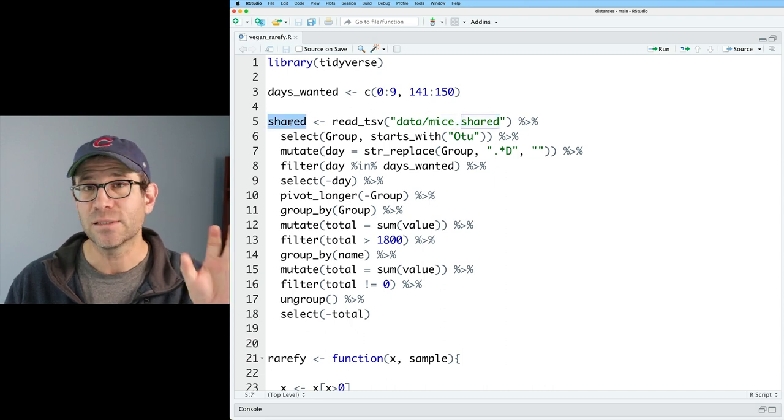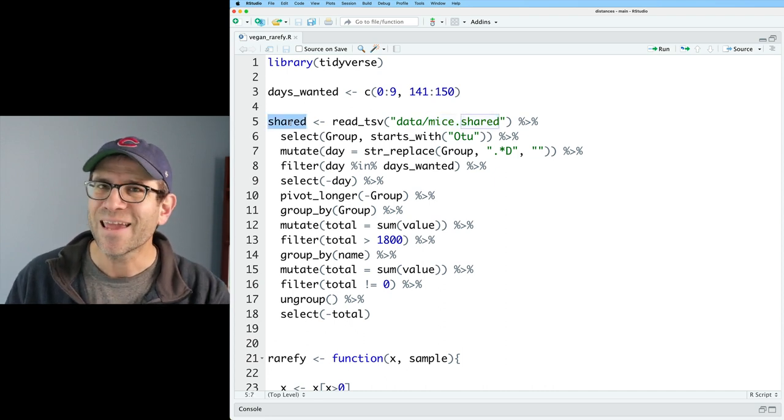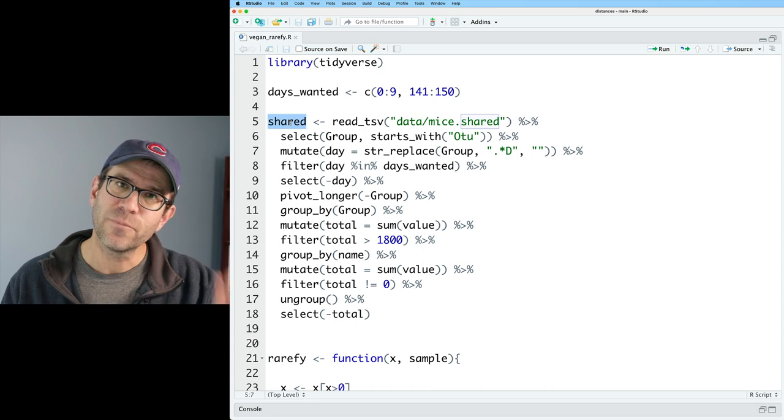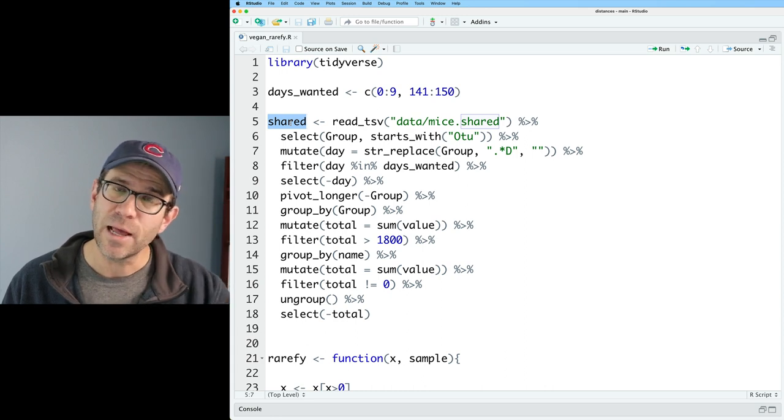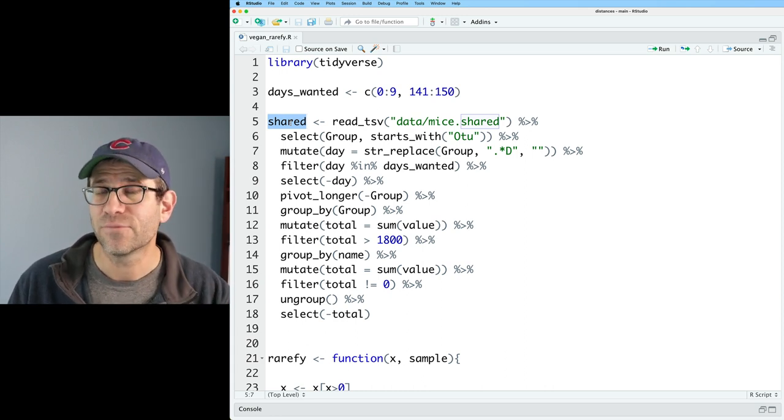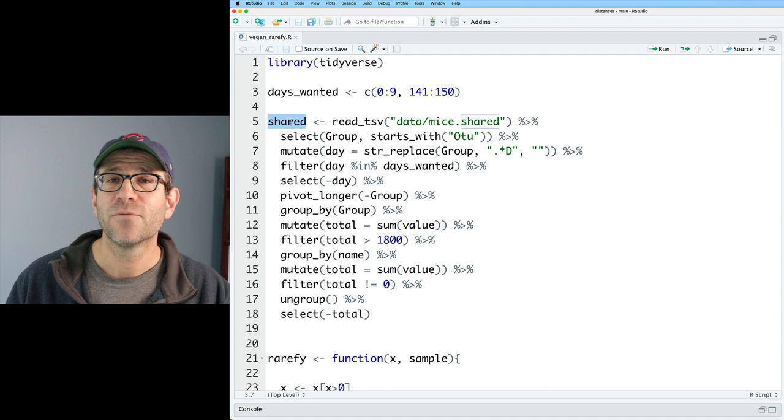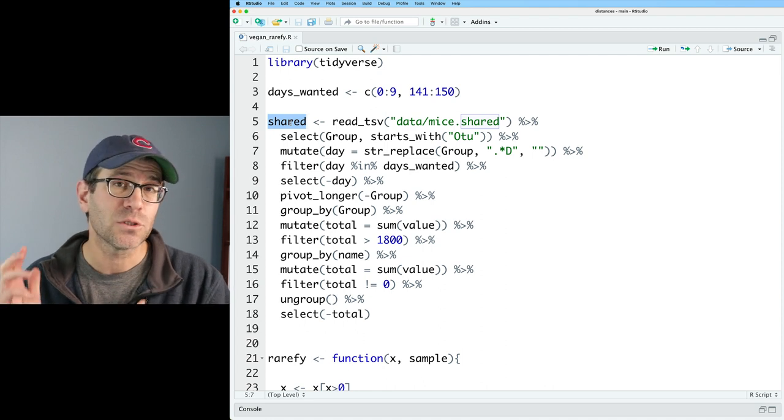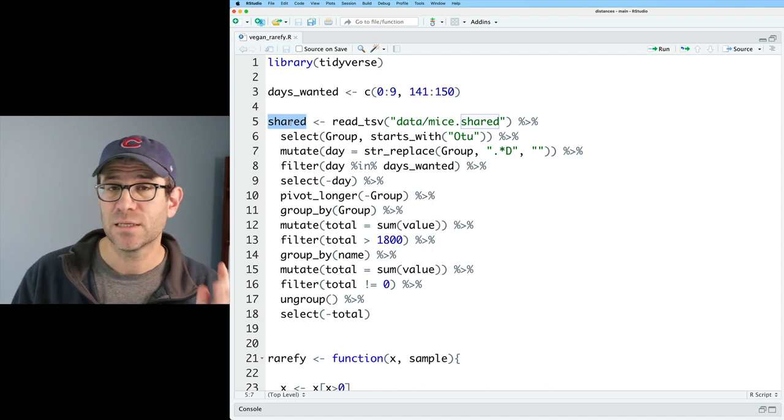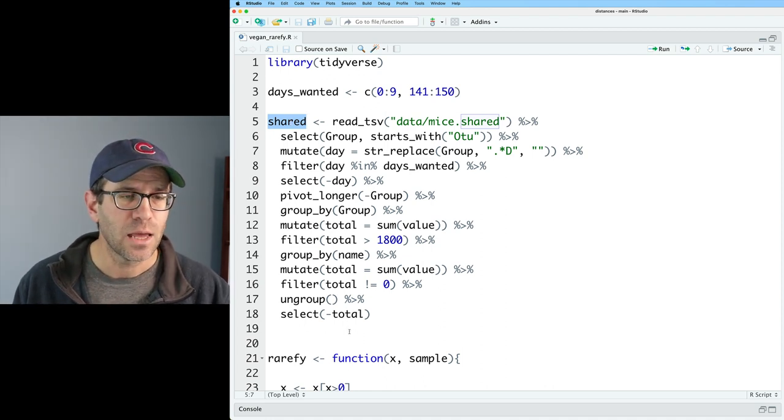So that's why I want to spend a little bit of time showing you how we can go through an object, a data frame, a tibble, like shared, which has a column for the sample ID, a column for the different taxa, and then a column for the number of times we saw each taxa in each of our samples.